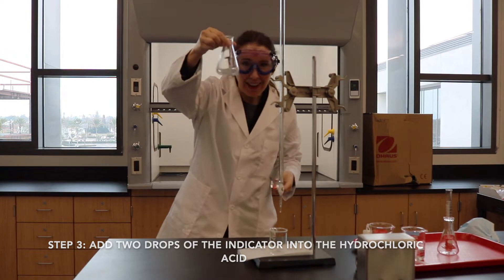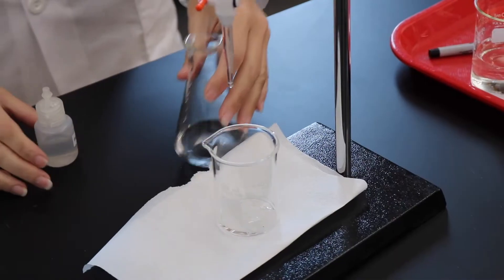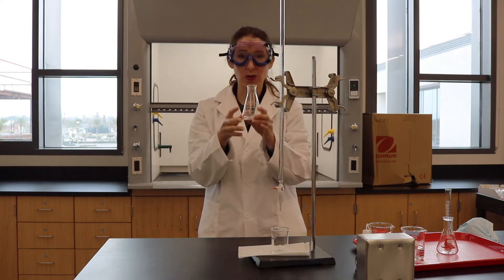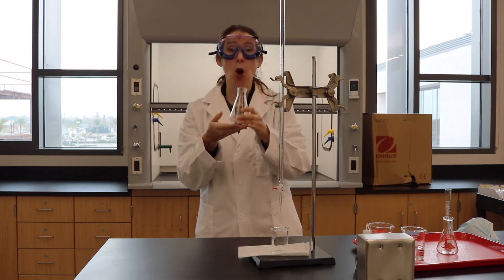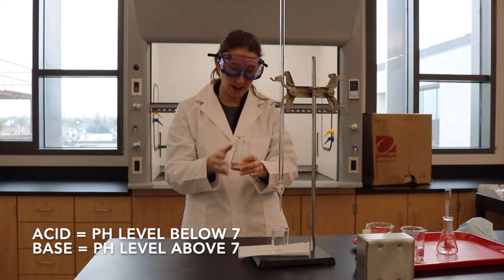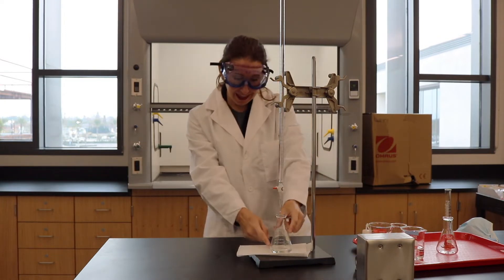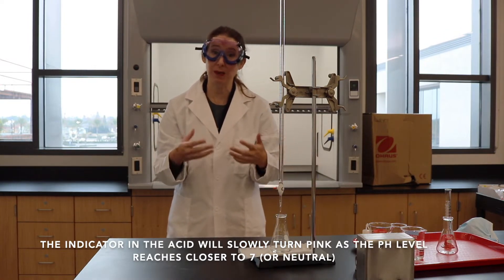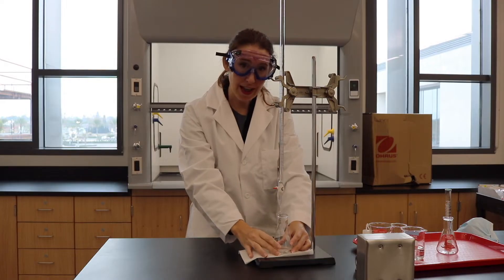You can see nothing happened — it's still colorless, meaning there's no color here. Now what I'm going to do in a titration is add this base to the acid. The indicator is colorless when it's a low pH or an acidic pH, which is below 7 on our pH scale. When the pH becomes neutral, this indicator will turn pink — so in a basic solution it would be pink.